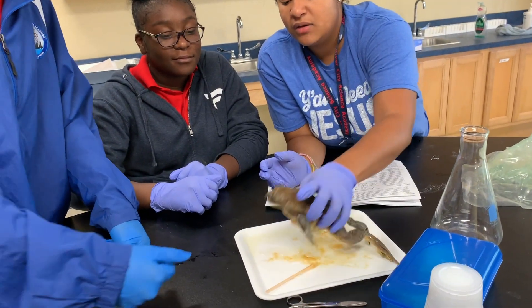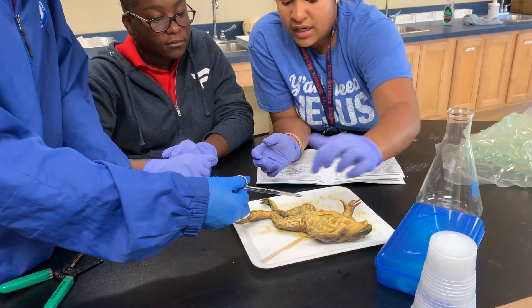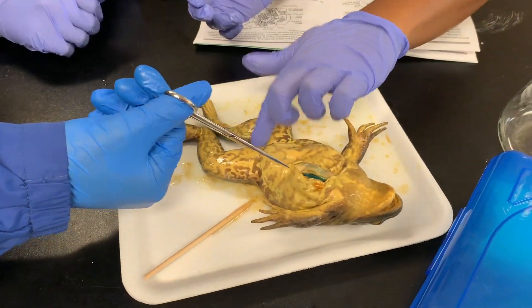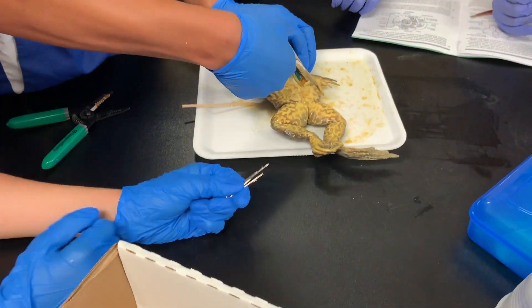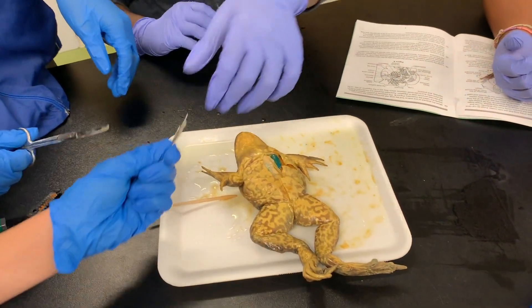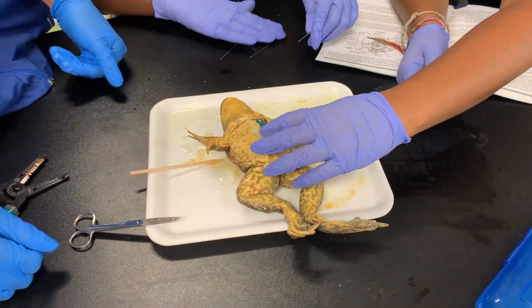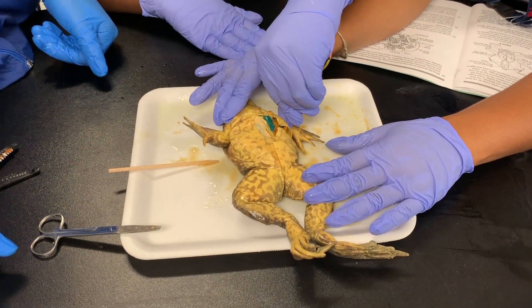There are two ways to do it. The easiest and safest way — so you don't make too big of a mess — is to use scissors. There's already an incision right here. Extend the incision all the way up here and all the way down here. We're going to pierce through his hands to hold him down, and then pierce these flaps to keep them open.